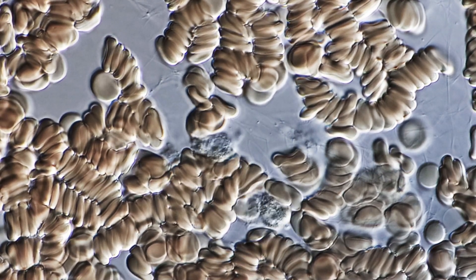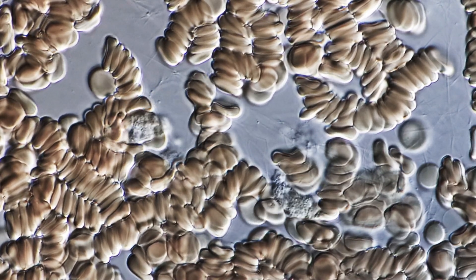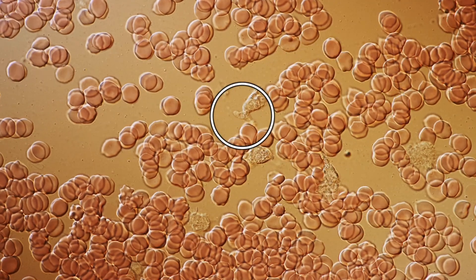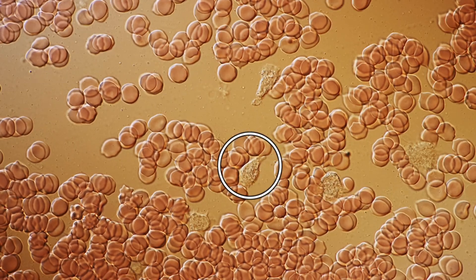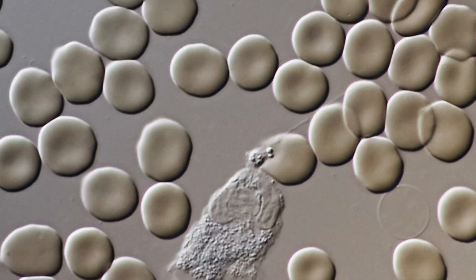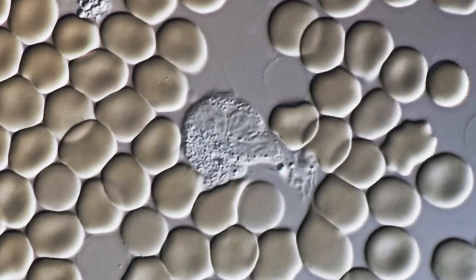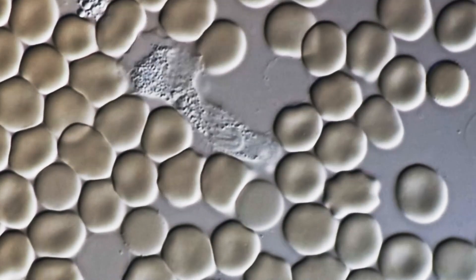Here in time-lapse — I really increased the speed — their motion looks quite a bit like amoebas. Making this video took quite a bit of patience because they do move very slowly and are easy to overlook. But if you film them for about half an hour and speed up the video 10 to 20 times, you're able to see quite well that they're able to move. I think it's quite amazing that so many tiny cells are constantly working to keep us healthy. Those white blood cells had no problems surviving at room temperature on my microscope slide — even though it's much colder than body temperature, they still moved around and were actively searching for things to eat.